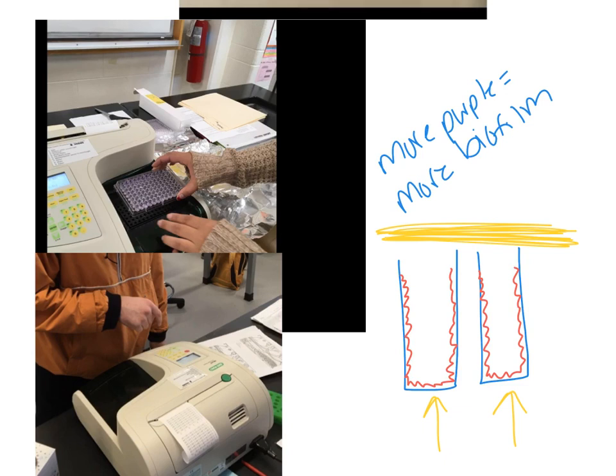So if I have a greater amount of biofilm, like let's say this one on the left has more biofilm than the one on the right, I would expect to see a larger number, meaning that more of the light was blocked by the contents of that well.